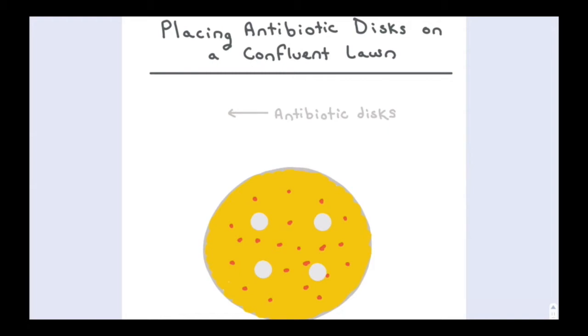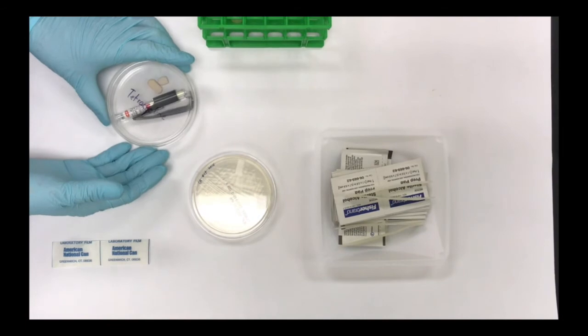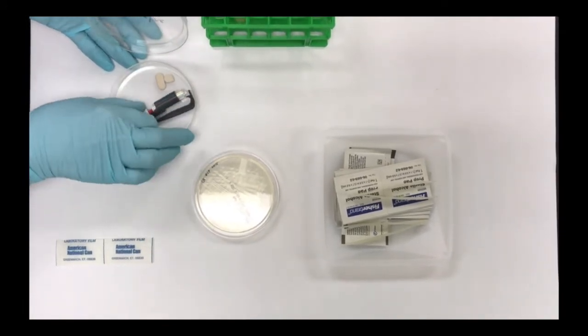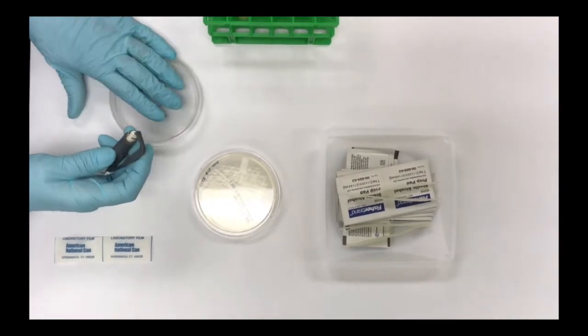Now, you can't just pick up the antibiotic discs with your fingers. They're not just lying around, because then they would be contaminated. Rather, they are being held in an antibiotic disc dispenser, and you can see here that's in its own plate. And the little tablet that's in there with it is just trying to keep it dry. So that tablet is making sure that moisture doesn't get to the discs.